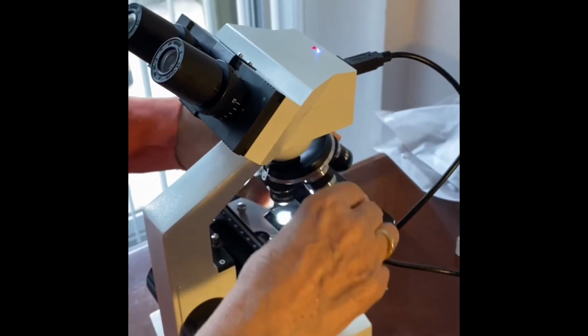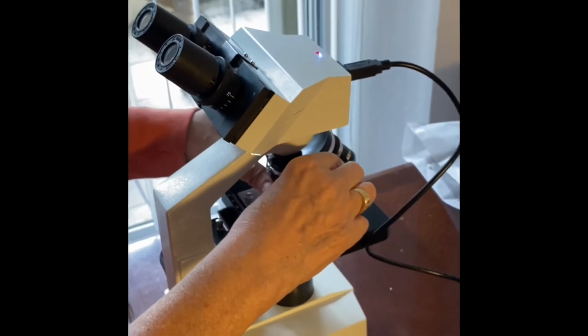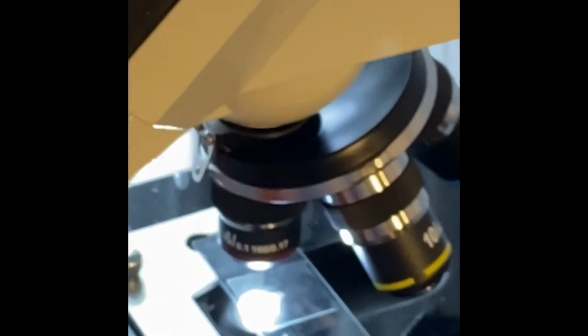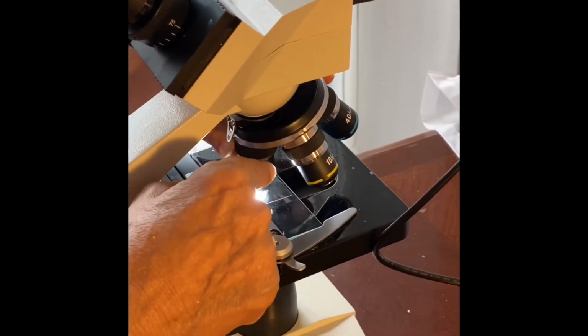Move to the objectives. There may be 2 to 4 objectives on your microscope, depending on what microscope you have. These are the objectives. They're on this nose piece here. The first one is the lowest power.